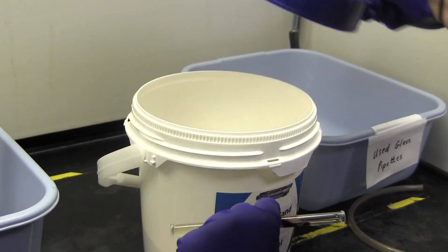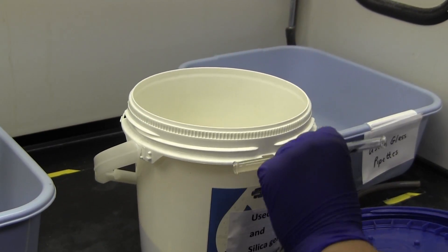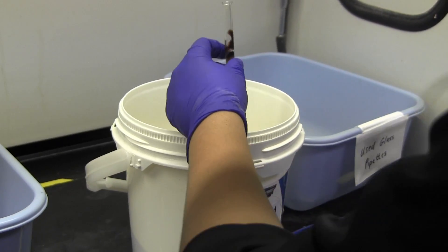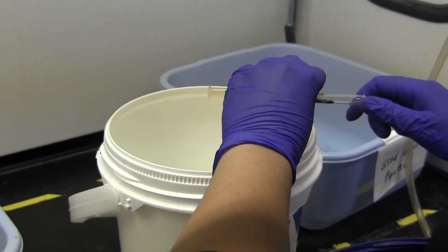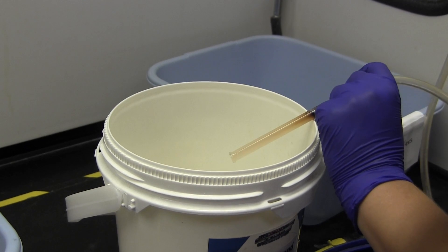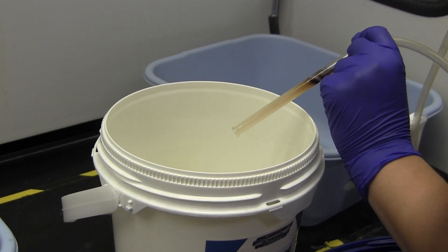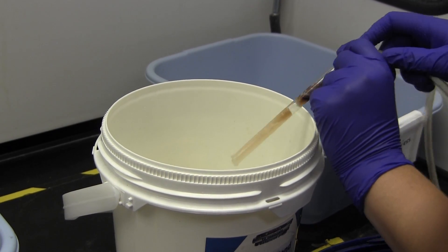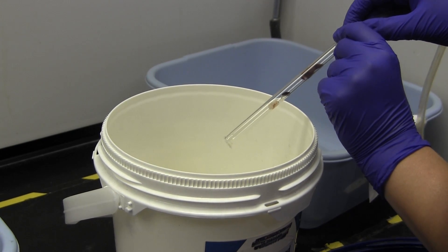When you finish the lab, dispose of your used silica gel in the silica gel waste container, located in the waste hood. First, take the stopcock off of the bottom of your column. Then use nitrogen to push the silica gel out of the tube straight into the waste container. Then, cap the waste container and wash your column with acetone.